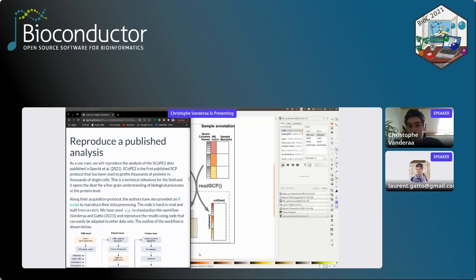Okay, maybe I'll just put in the chat what you should set. So what I suggest now is you using the development version. I'll type it in the chat. I suggest you use the development version, because lately there were quite some changes. During the new Bioconductor release, quite some new changes will be made, and namely we refactored a bit the names to make them more clear.